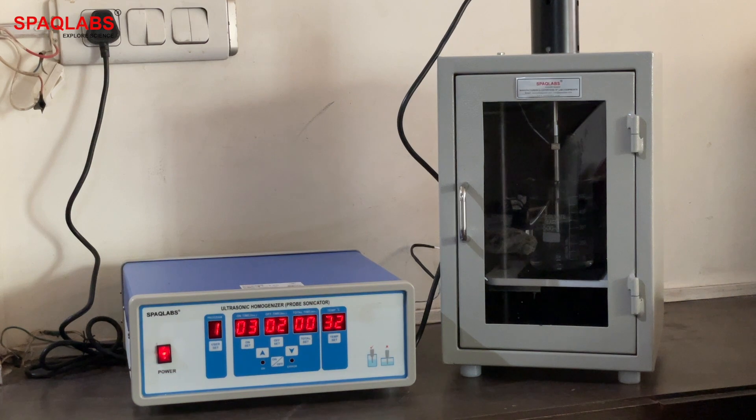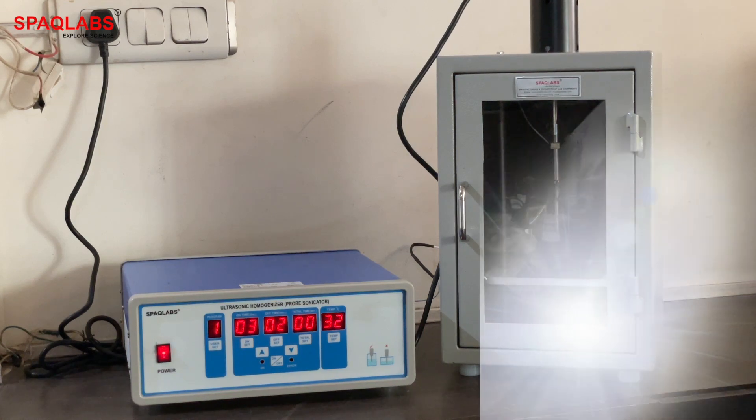One minute is now completed. A beep signal indicates that the cycle is finished. The sonicator has completed its run in one minute.